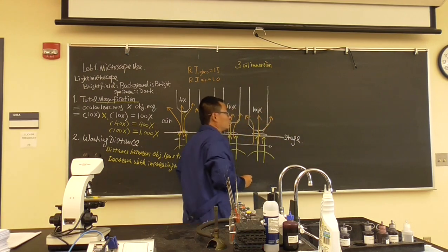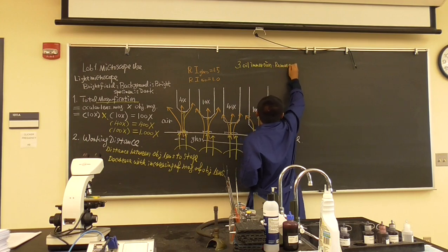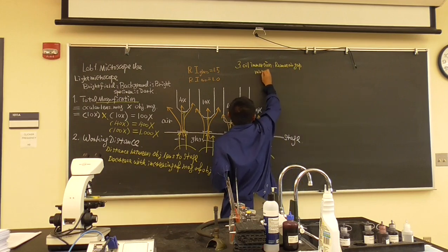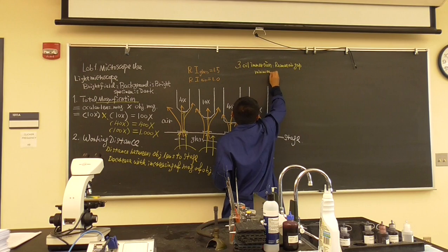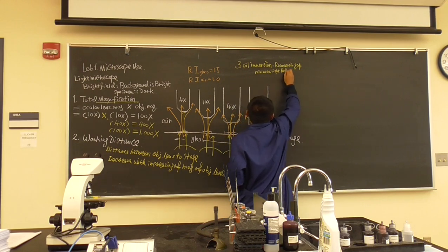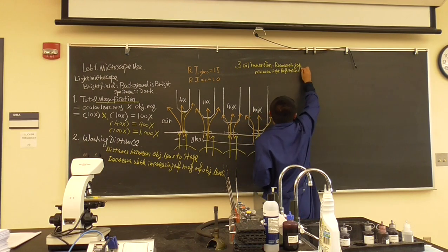What's the function of oil immersion? It removes the air gap and minimizes the light refraction effect.